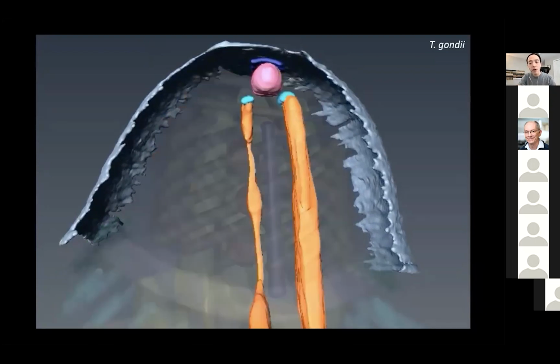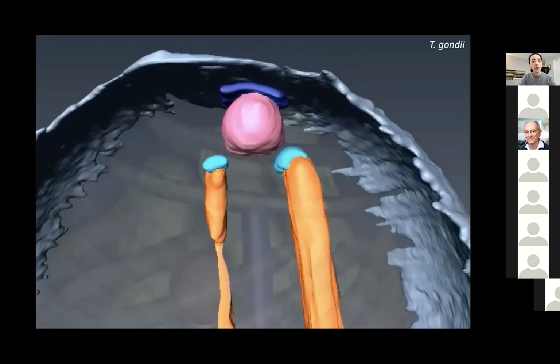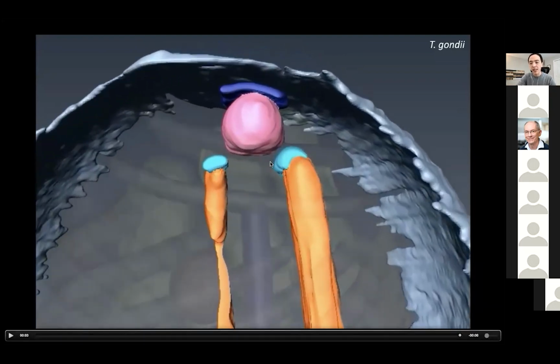Here, we also focus on the rhoptries inside this area. And indeed, we also saw some tip densities on the rhoptry, and then we also saw a big membrane vesicle in front of the rhoptry docked by the proteinaceous density on the plasma membrane. But in addition, we always see two rhoptries docked to one AV in each tomogram, compared to Crypto. Crypto only has one rhoptry.